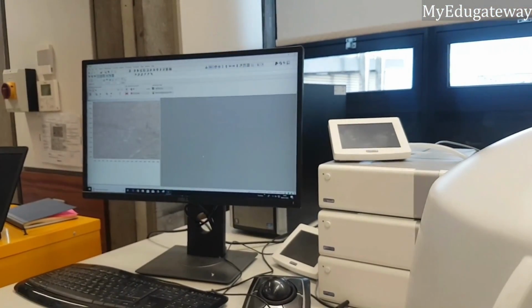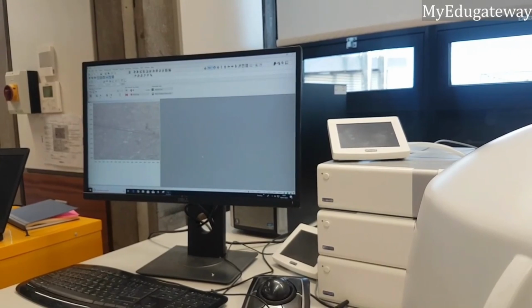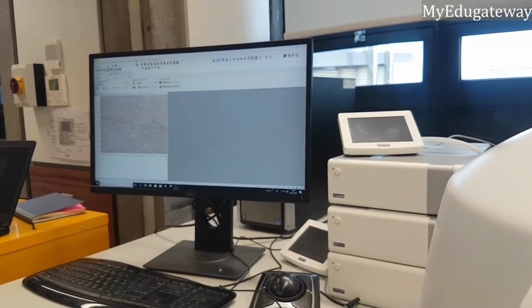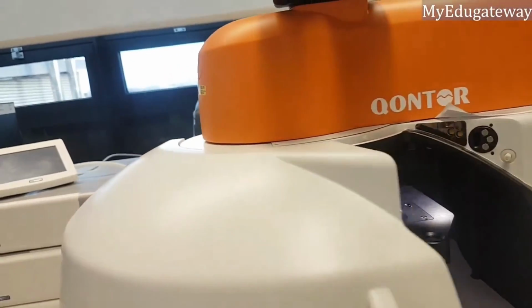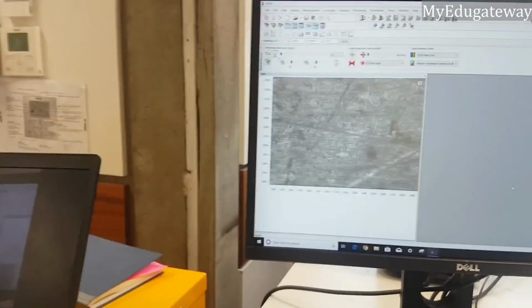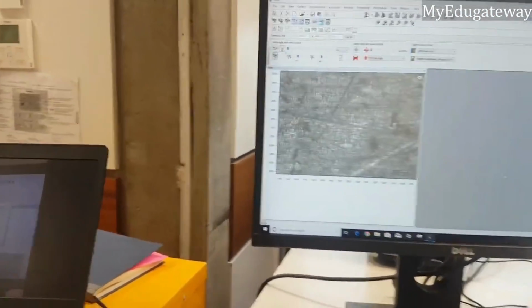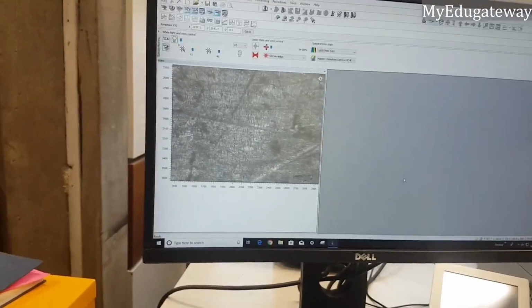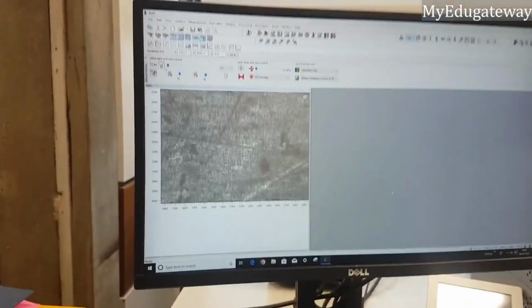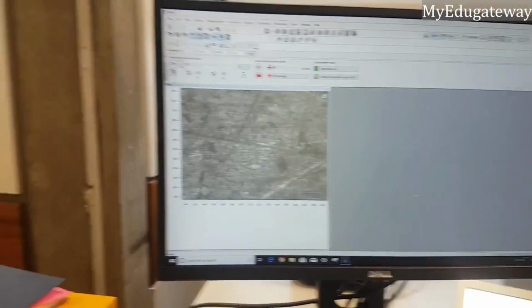So let us focus this. Okay, I think that is focused now. Then you close. So let us check our laser beam if it's working.